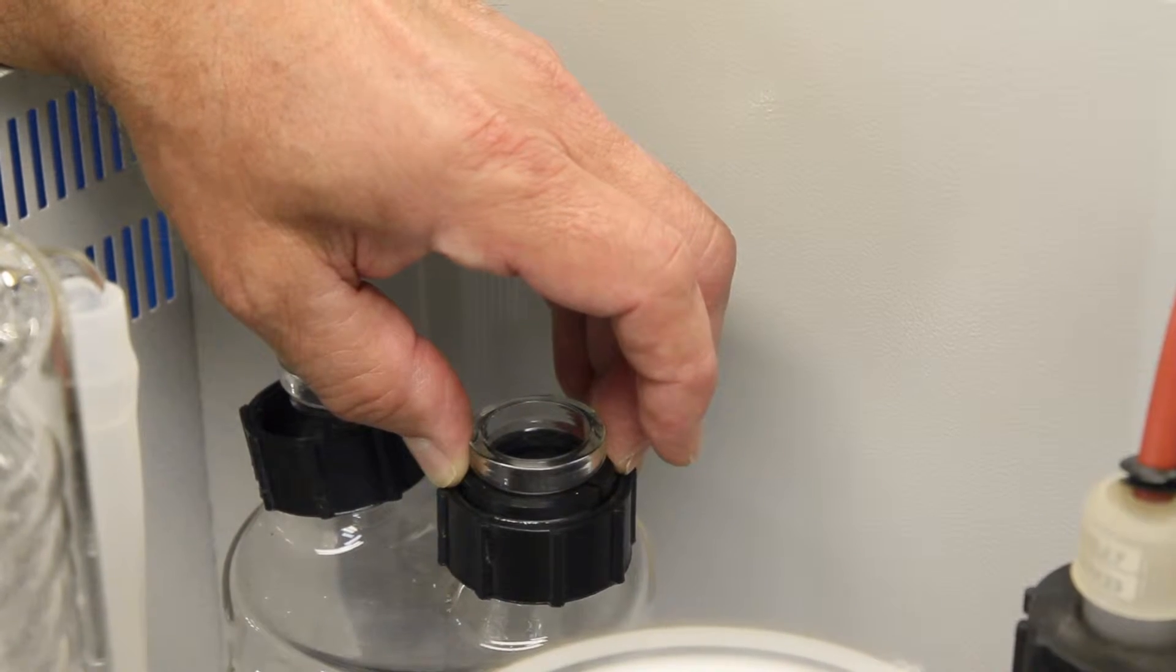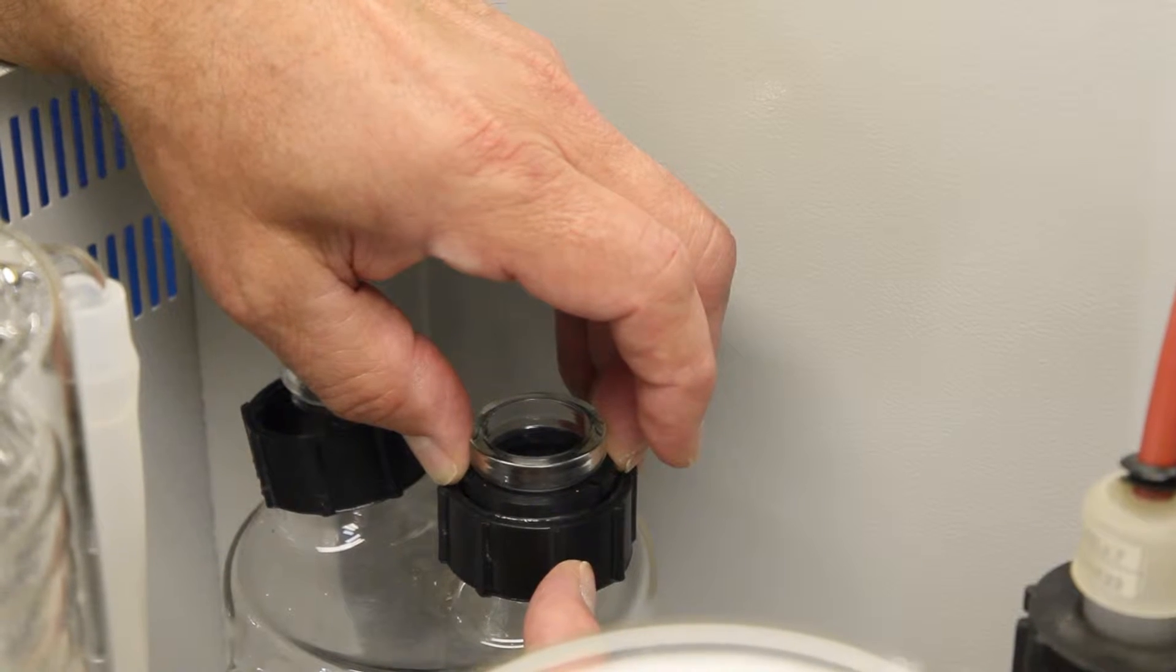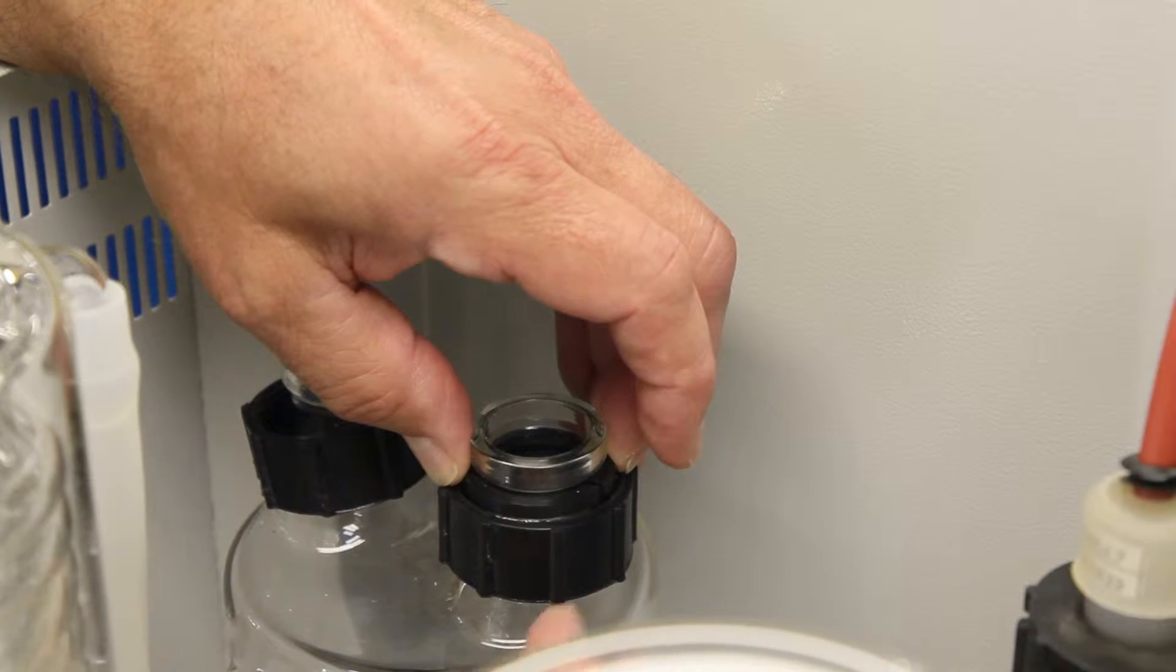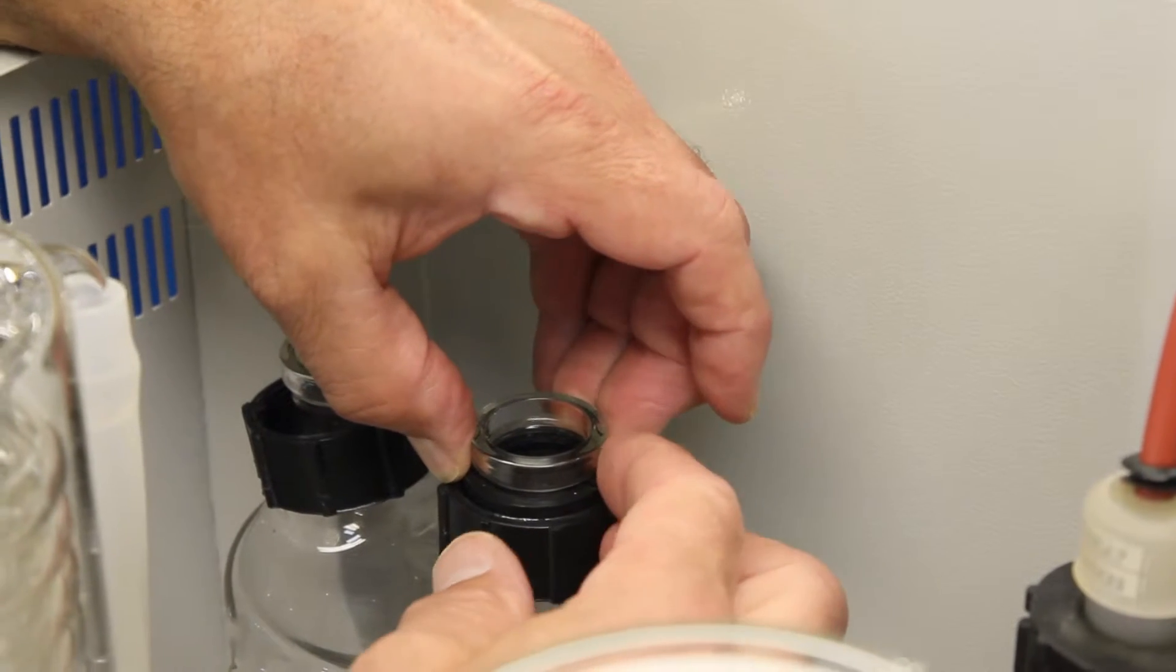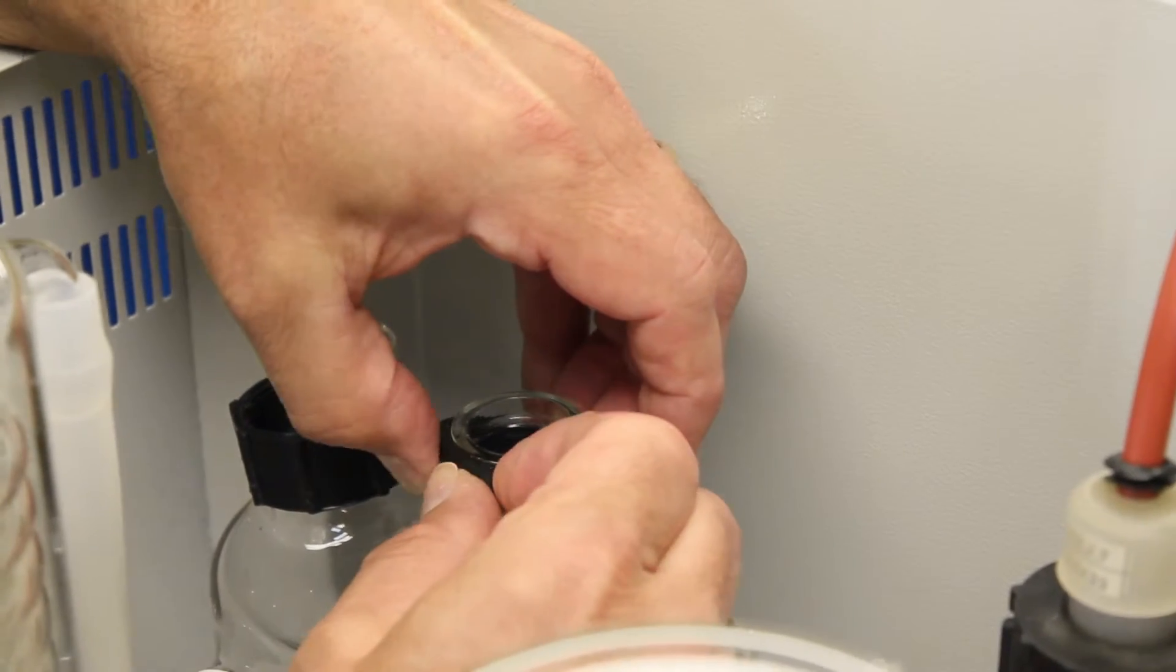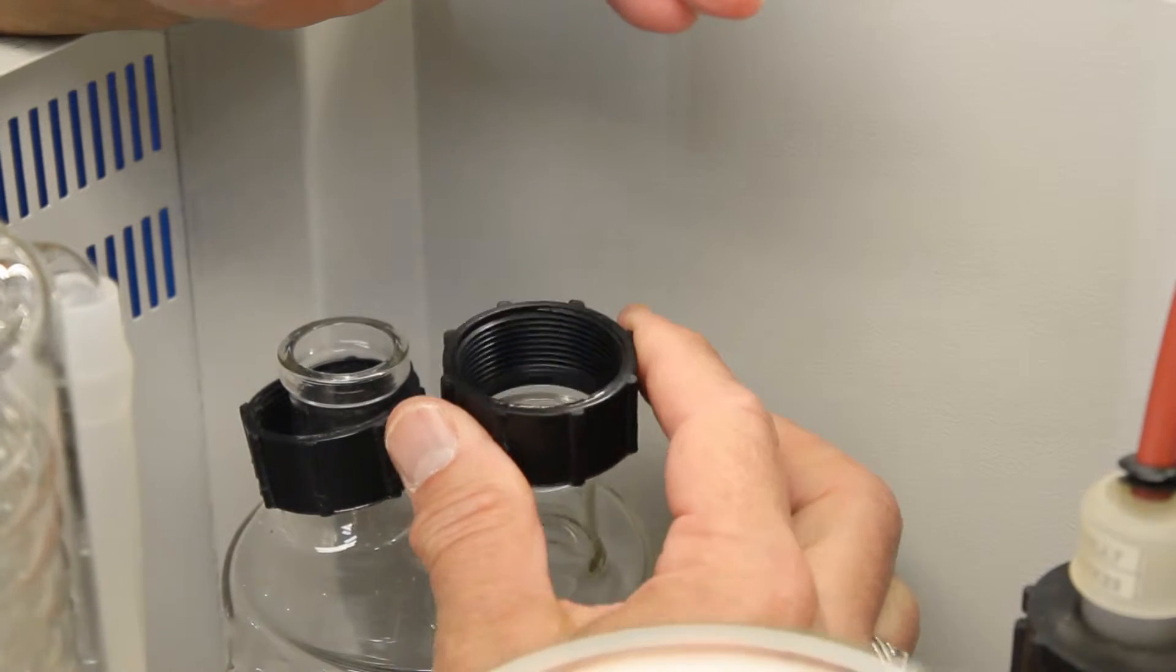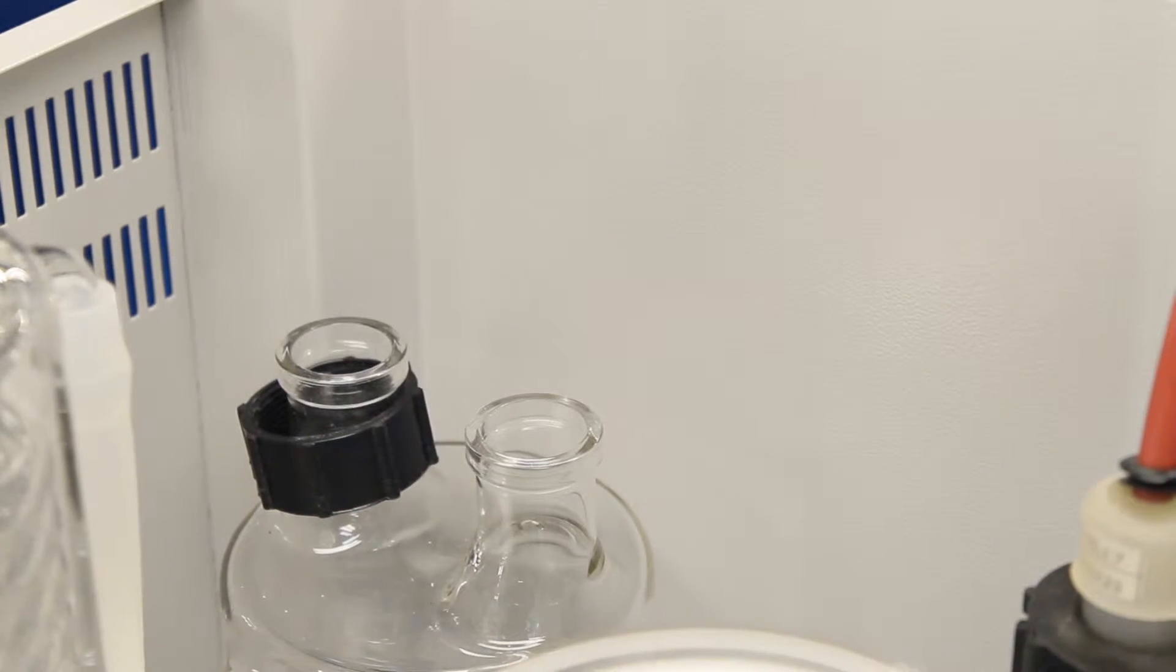Now that you have the element removed, you're going to need to remove the split ring and the bottom half of the plastic union because your new boiler will not have that with the boiler, so you need to take it off the old boiler. Take your split ring, find where it's split apart, and you need to pull those apart. Then pull the plastic union up and you'll do the same thing for the other side.